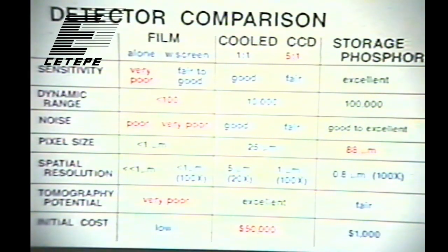How big is yours? Our CCD? Yeah. Our CCD is 1 inch format. 1 inch. Yeah. So in our input X-ray image, we have a choice on our intensifier between 9 inches, 7 inches, and 5 inches. So the input, you can magnify the specimen to either 5, 7, or 9 inches.